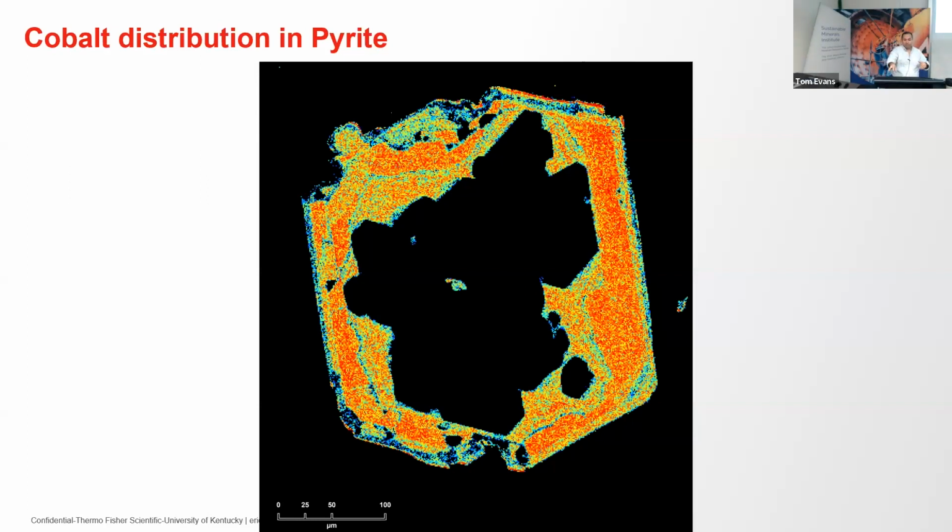For example, in the case of cobalt, the cobalt peak is actually very next to the K beta peak of iron. So if you are interested particularly in cobalt in pyrite, then the detection limit for cobalt is going to be a little bit higher than if you have pure cobalt, the pure metal. The same happens for all the elements, depending on what accelerating voltage you use and in which mineral they are analyzed. So there is not a straight answer to that, but in this case, it was around 0.3, 0.4%.